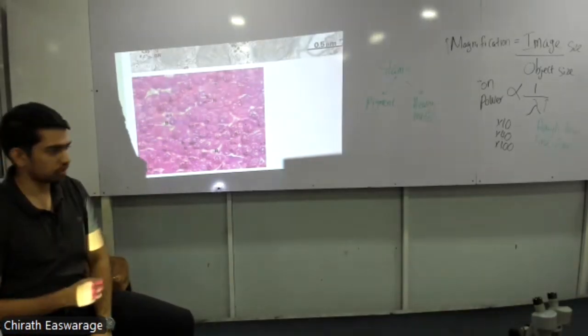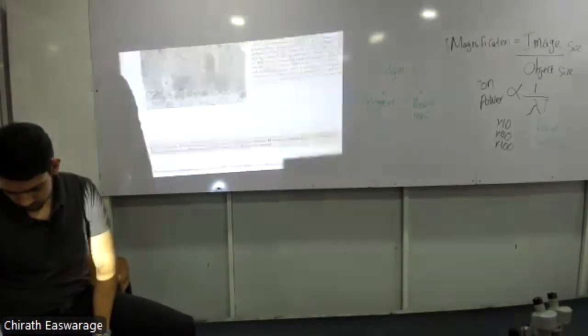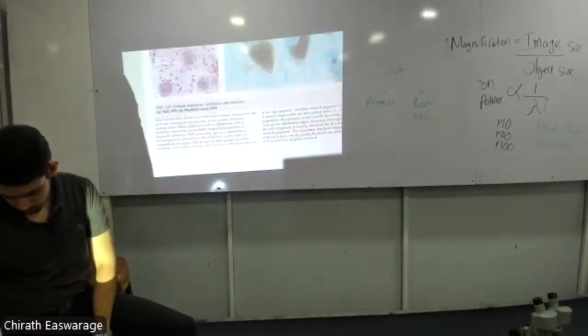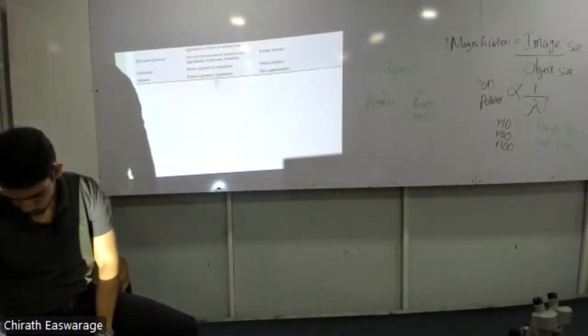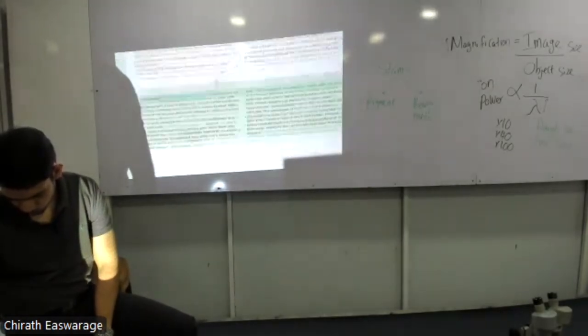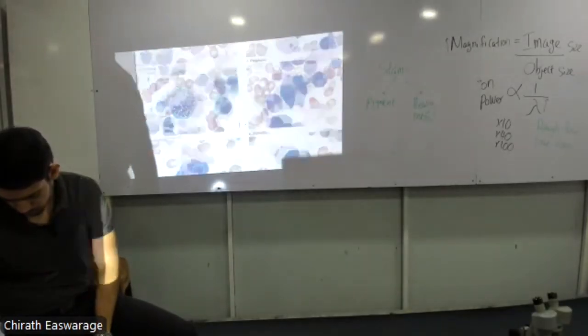Screenshot tag, right? You can take digital images from the screen. You can take photos, right? Some things, very rare scanning electron microscope images.